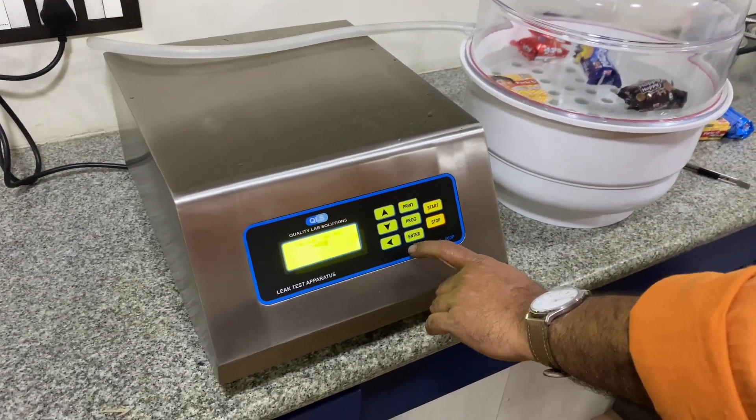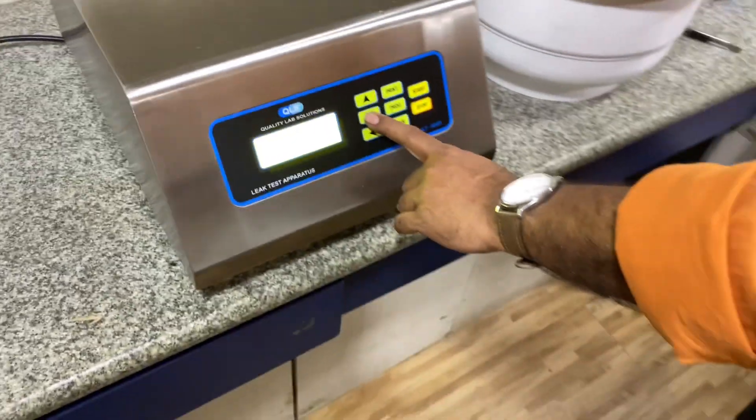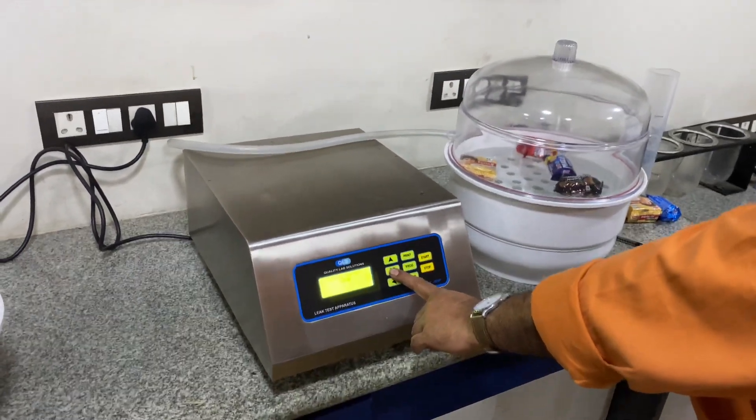This is a demonstration and operational video for the leak test apparatus by Quality Lab Solution. We are conducting a small test over here and will start with the programming.